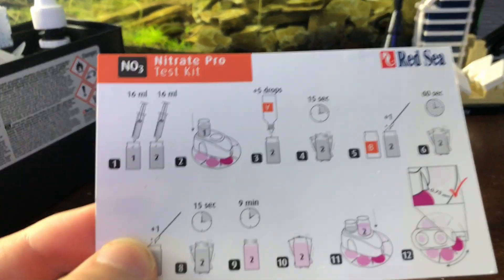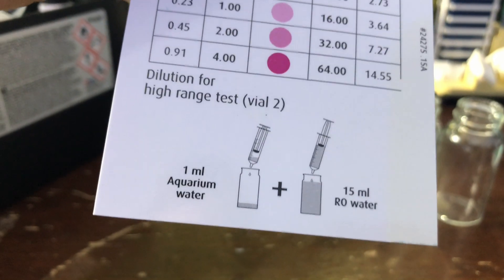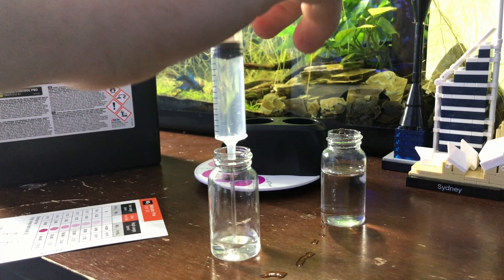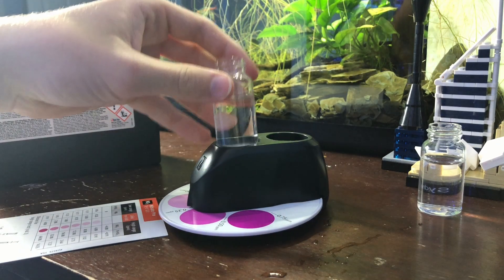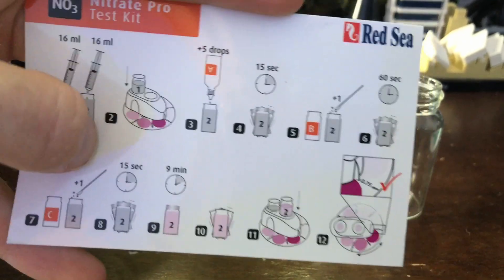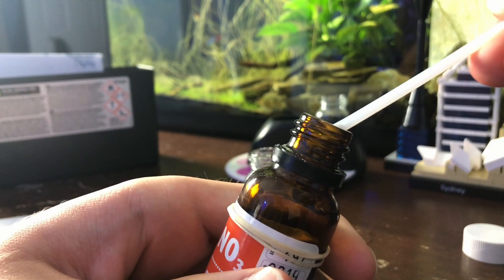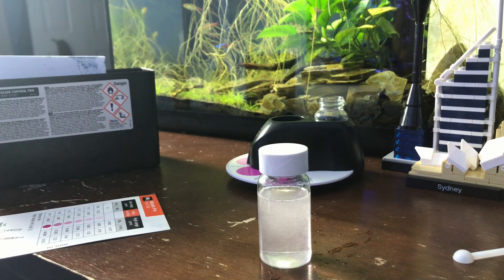The nitrate card shows you the instructions. First, you get 16 milliliters of tank water. I'm actually going to do the diluted test, which is 15 milliliters of RO water and one milliliter of aquarium water — that tests the high range. If you have nitrates below four, you're fine, so there's really no point in doing the low range unless you're trying to get your nitrates up or checking your cycle. I just want to make sure they're at four or below. Once you have that, you put the control in the reading section. Add five drops of solution A to the test vial, shake for 15 seconds. Add one scoop of powder B, shake for 60 seconds — that takes a while to dissolve. Add one scoop of powder C, shake for 15 seconds. Then wait nine minutes for the color to fully react.